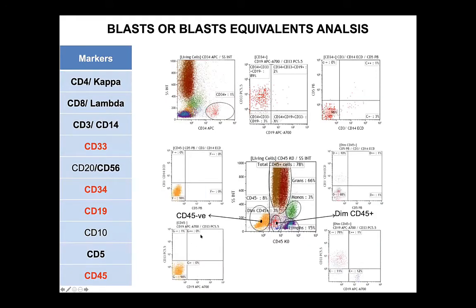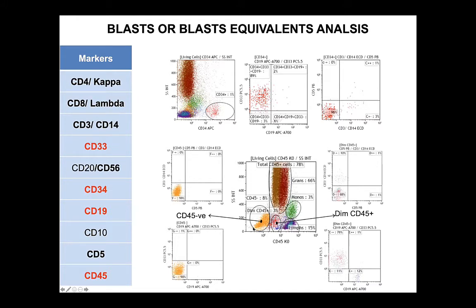With this antibody combination, we can enumerate the CD34 progenitor cells in a bone marrow sample. Also, we can subclassify them into B cell progenitors or myeloid progenitors. We can also screen for any apparent expression of CD3, CD14, or CD5. Similarly, we can investigate the BLAST region and the CD45-negative region, since B-ALL sometimes can present with negative CD45.